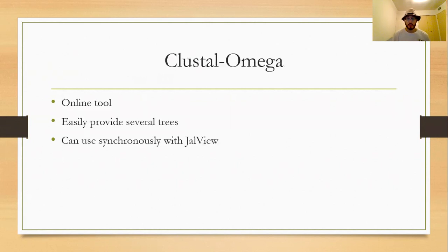Clustal Omega, I think, is a really good tool because it's online. It's got an amazing UI, and it's pretty intuitive, and it can generate lots of different trees.